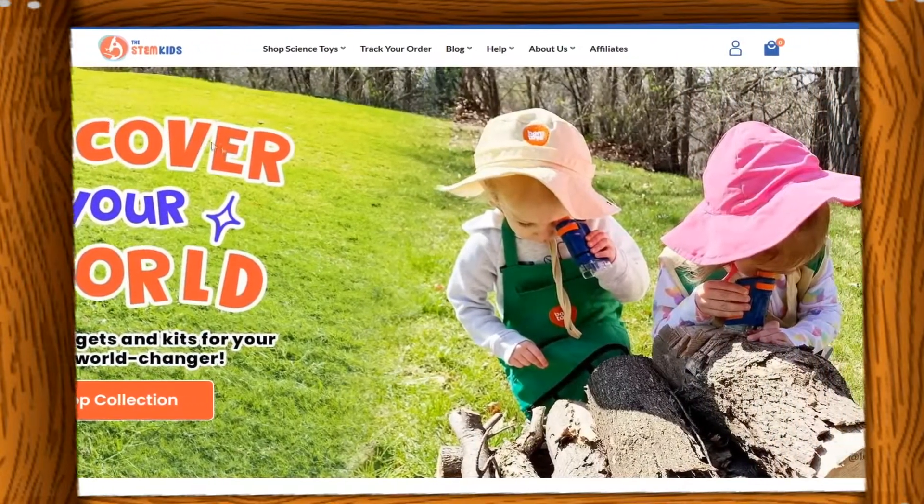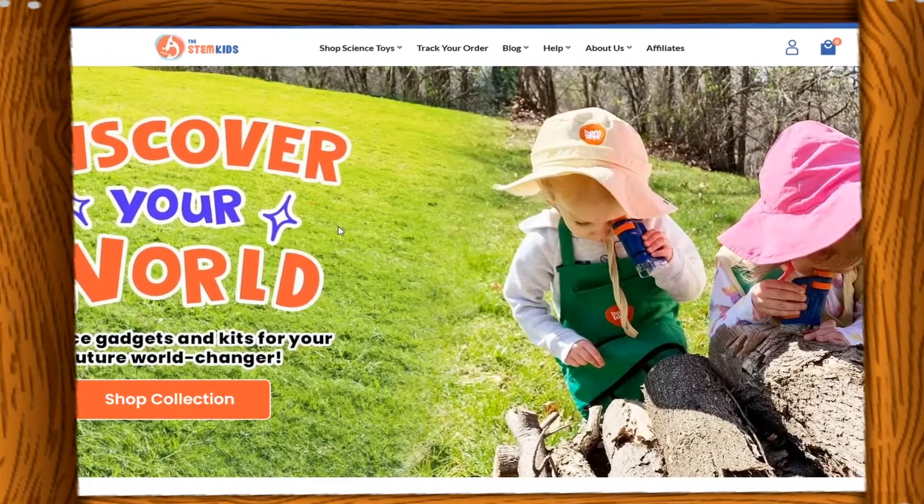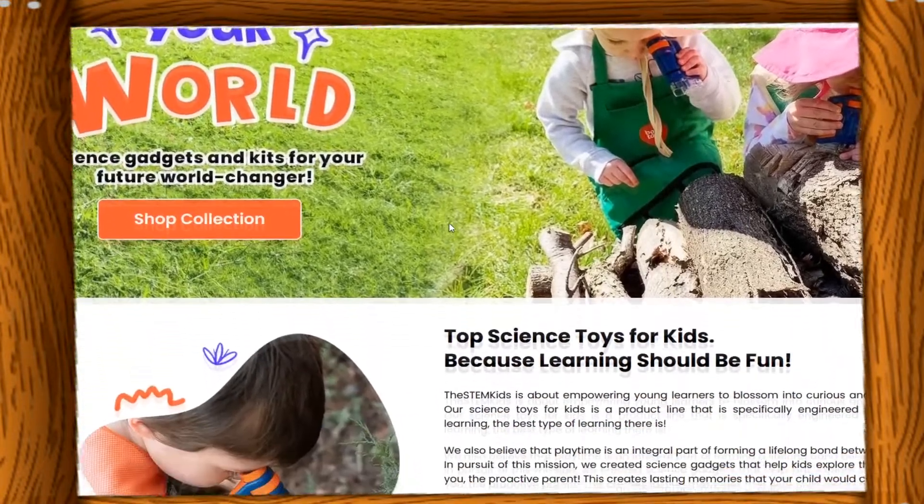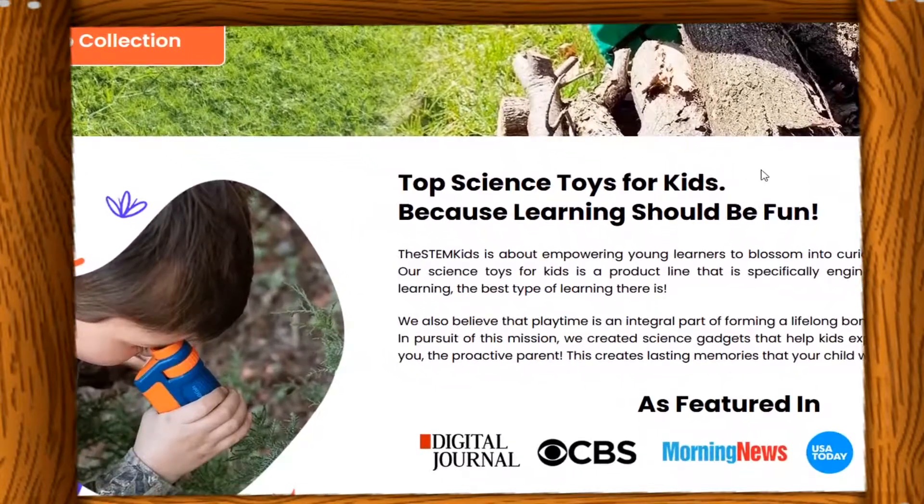I love their front page. Look at this — 'Discover Your World: Science Gadget and Kids for Your Future World Changer.' Looks very interesting, isn't it? And they sent me a portable microscope — I got two boxes here — and a box of slide kits with real specimens.